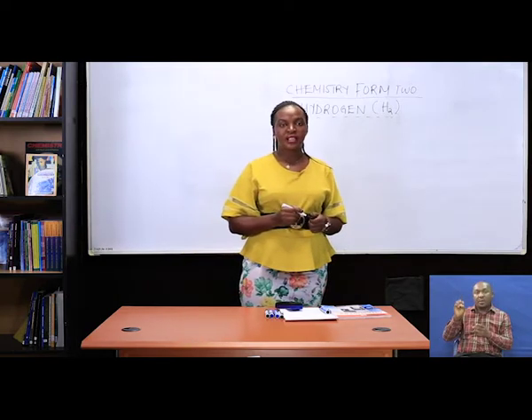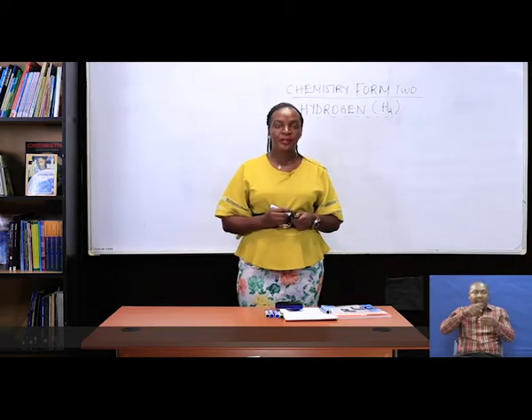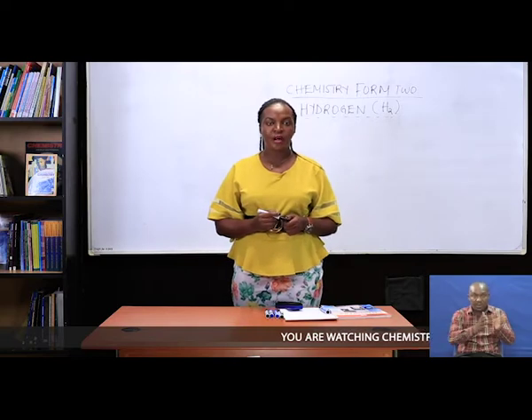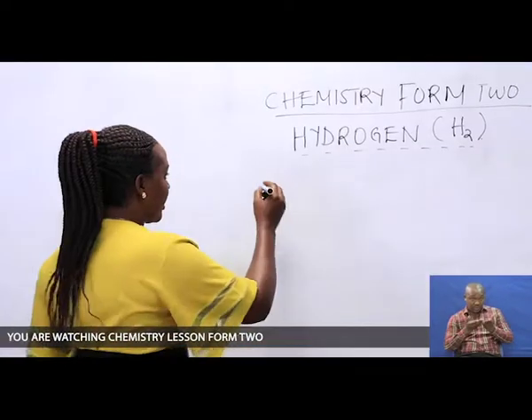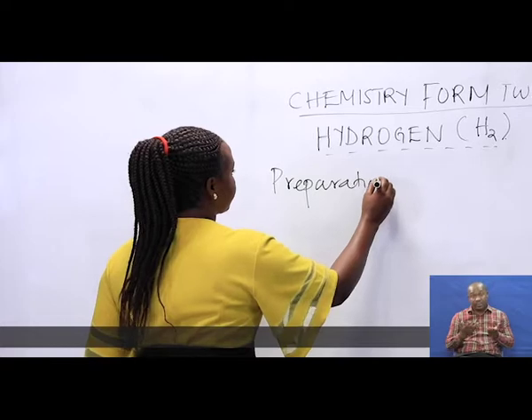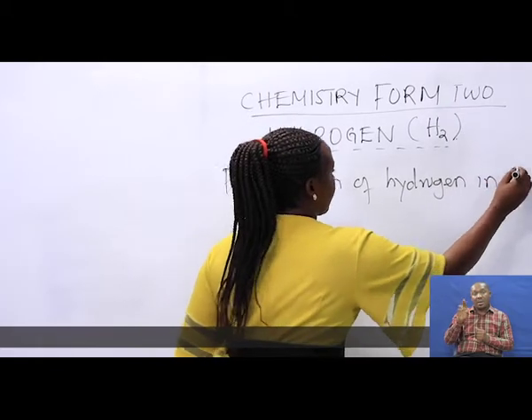Hydrogen is the lightest and most abundant element in the universe. Therefore, we can prepare hydrogen in the laboratory with different methods. Now, let us see how we can prepare hydrogen in the laboratory. Preparation of hydrogen in the laboratory.